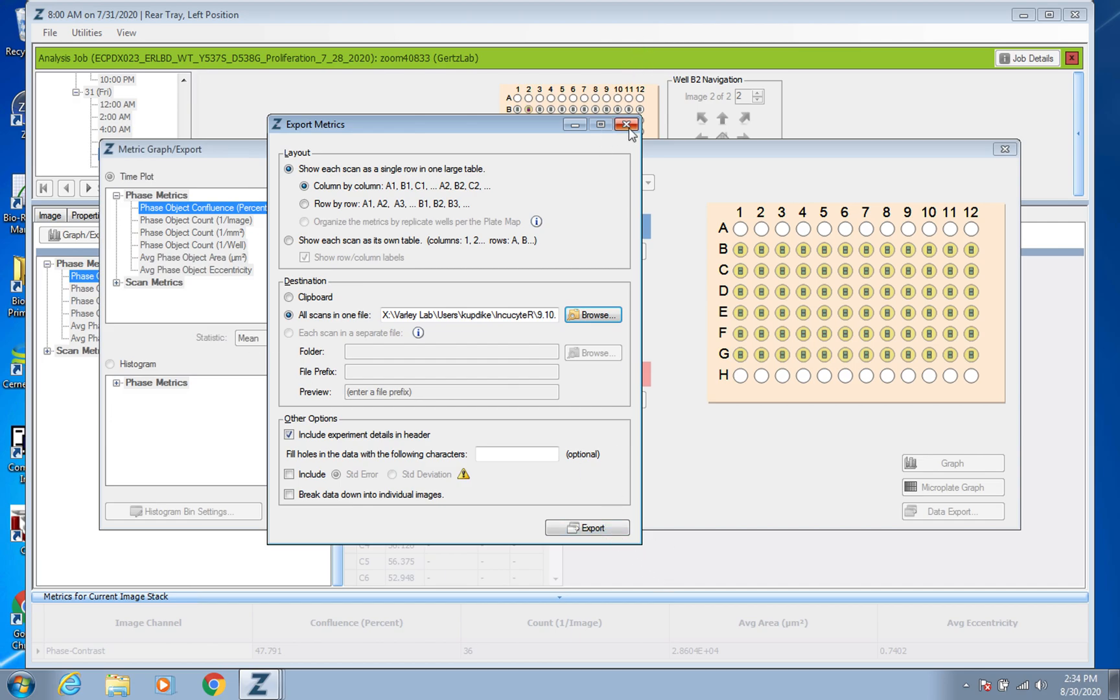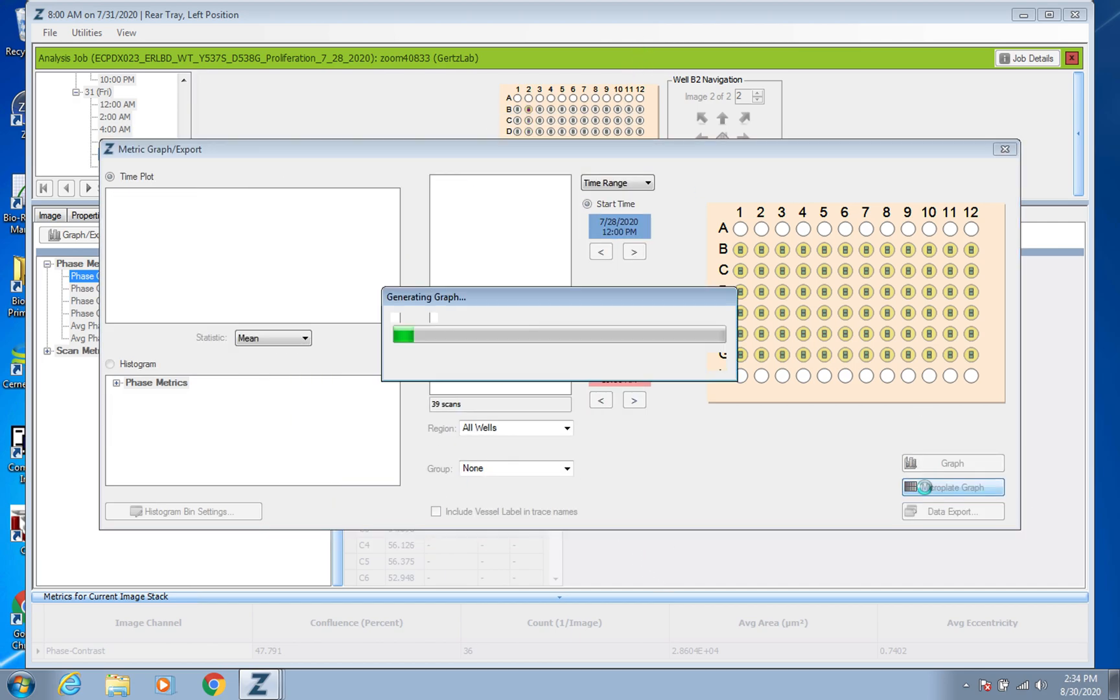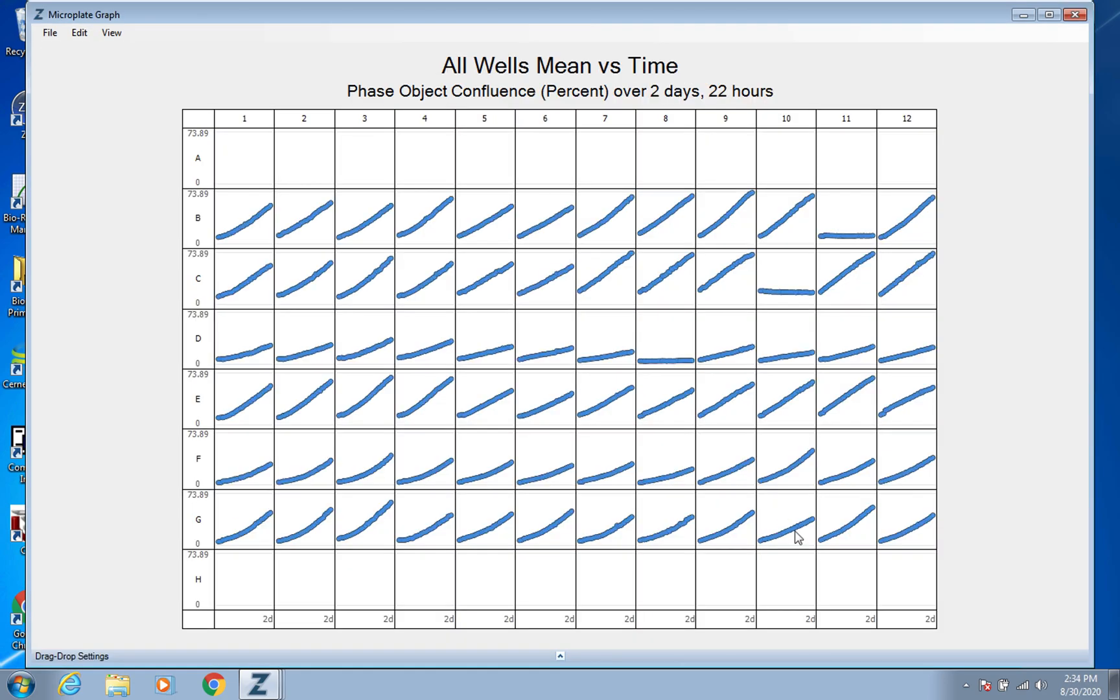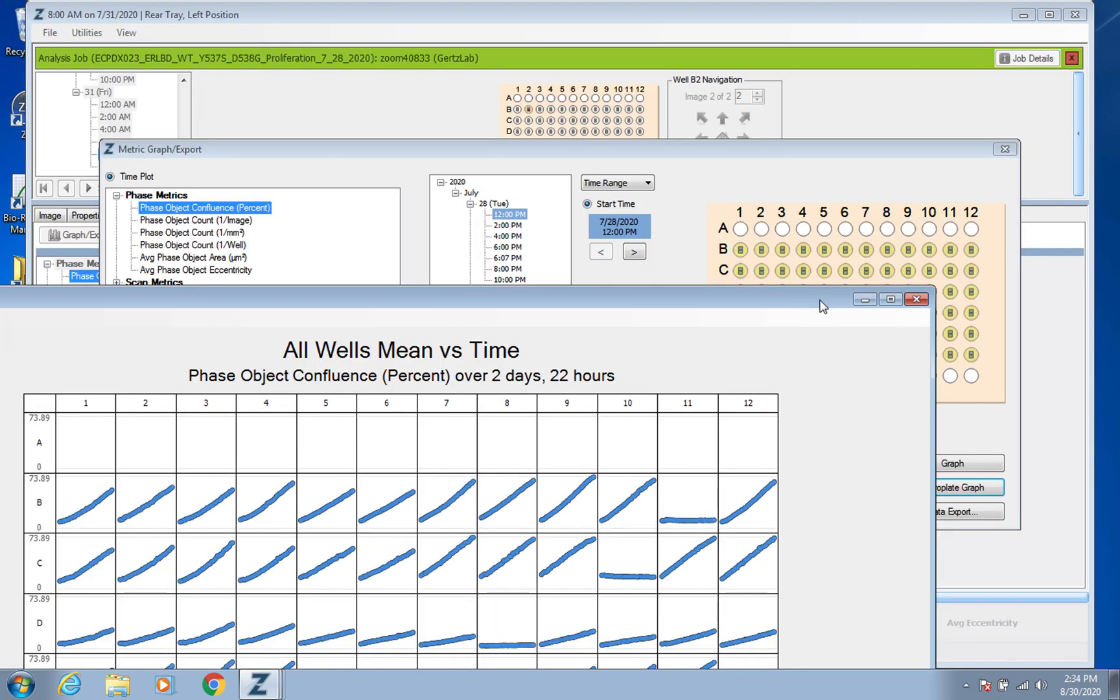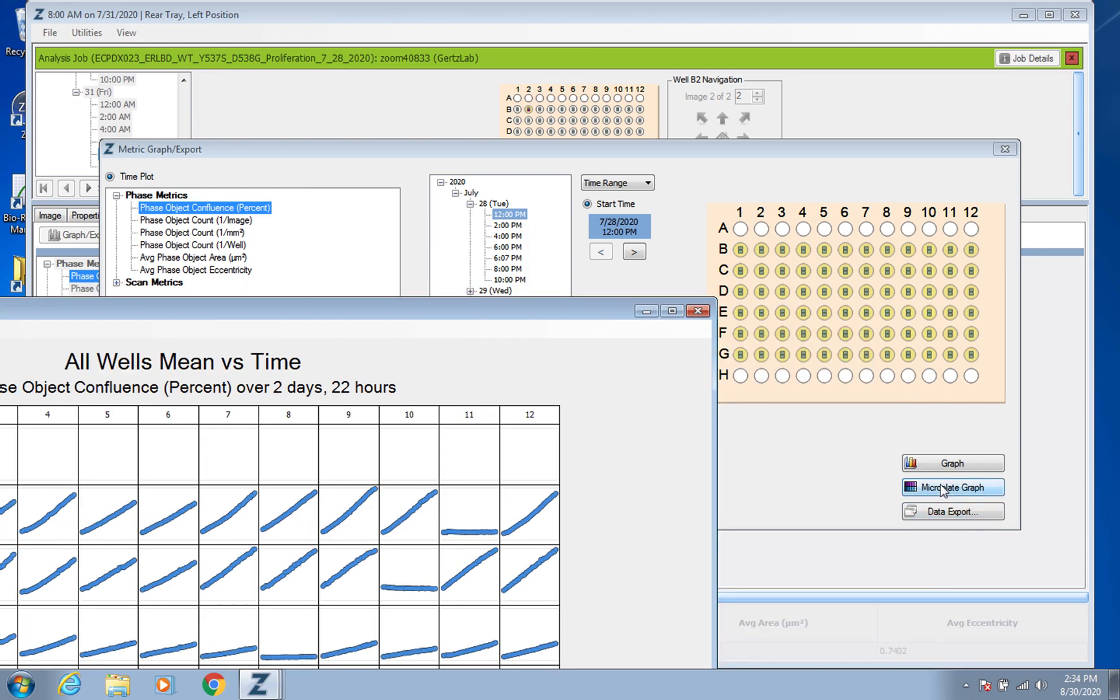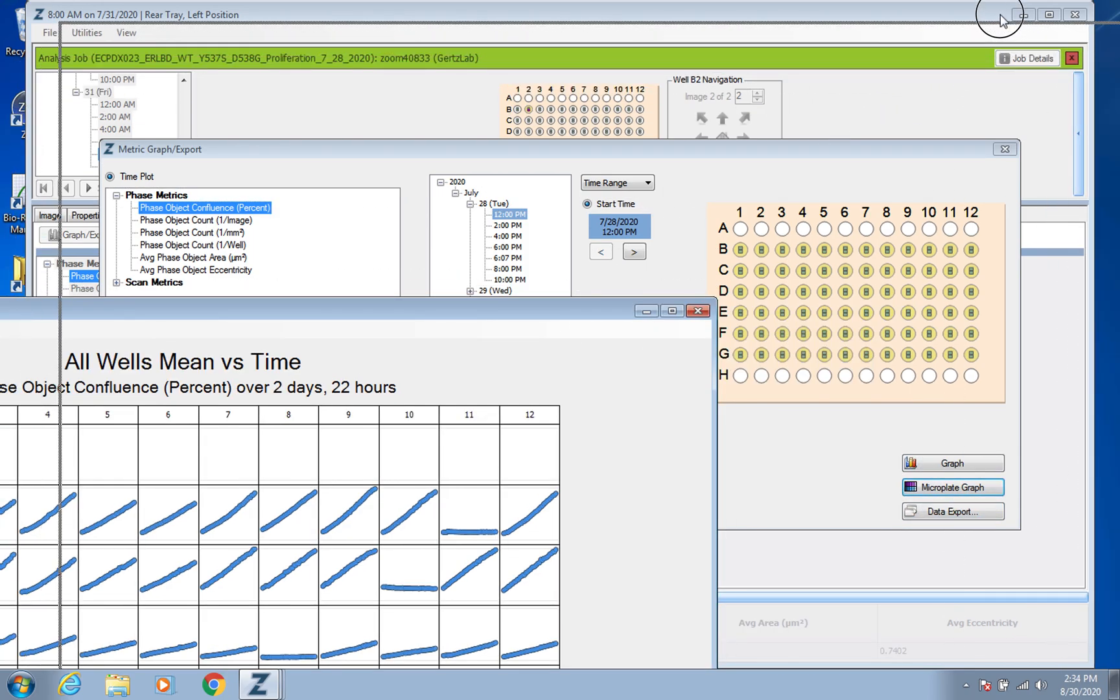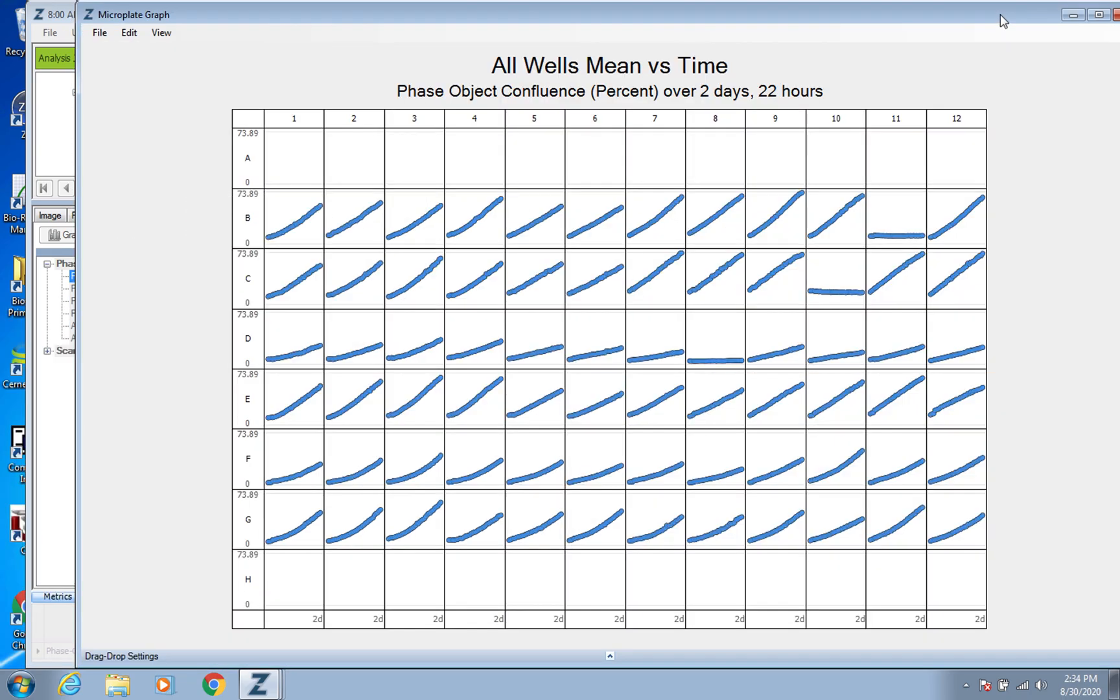The other kind of neat thing that it can do is this little, wow that showed up faster than I expected. So down here you see in the bottom right this Microplate Graph, you can click on that. Normally it can take some time to load but this just gives you a real quick glance at how your wells performed.